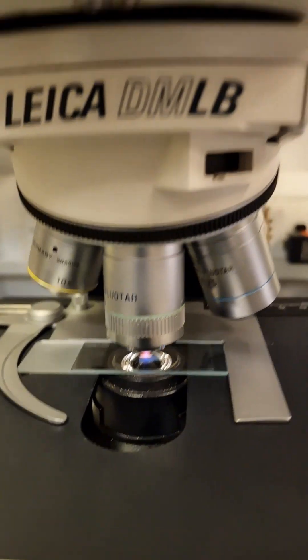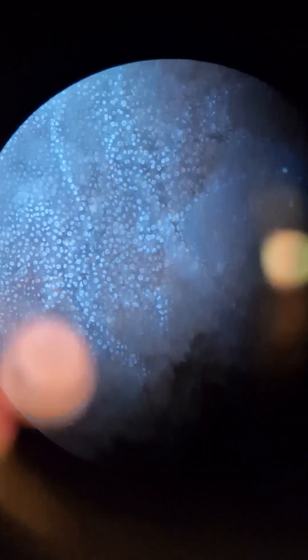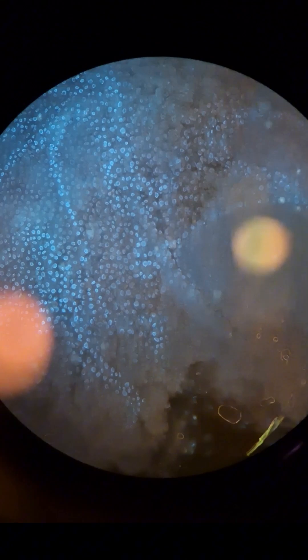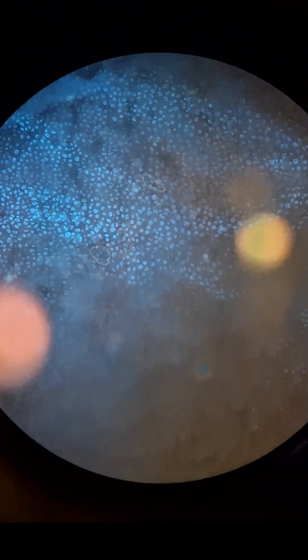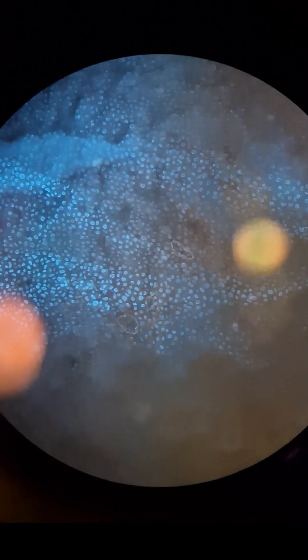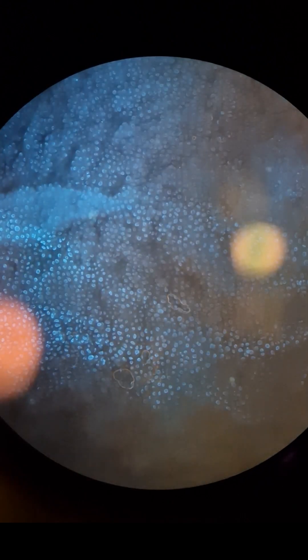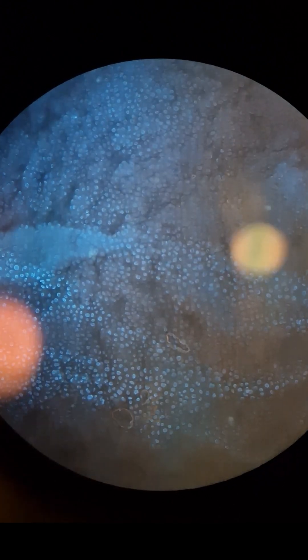Here we go. This is now the moment of truth. Looking down the microscope, it is pretty clear that there is clearly something. Every single bright blue dot is the center of an embryonic cell. You are looking at some of the earliest stages possible for a baby turtle. This never became one, but these are the cells that would have turned into one.